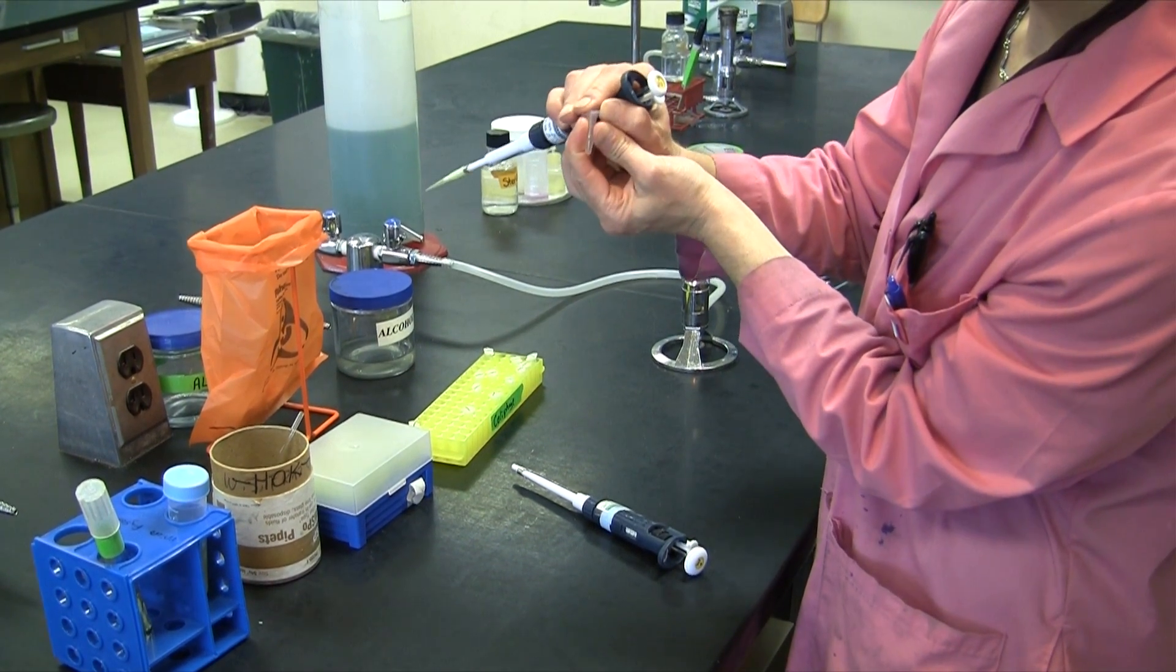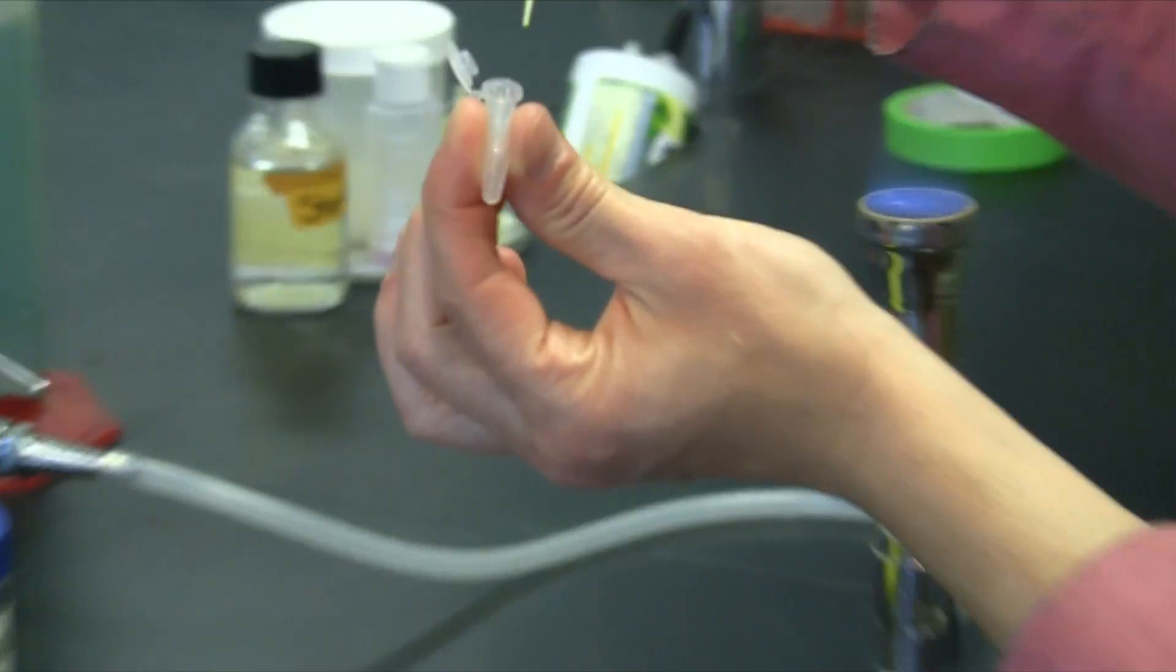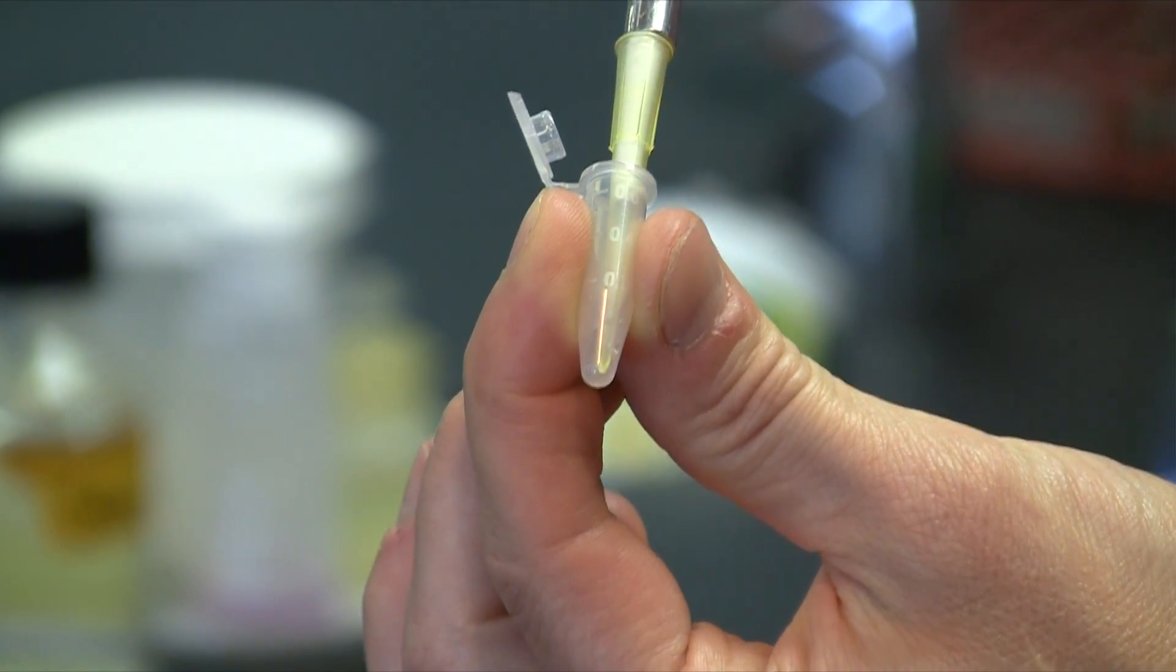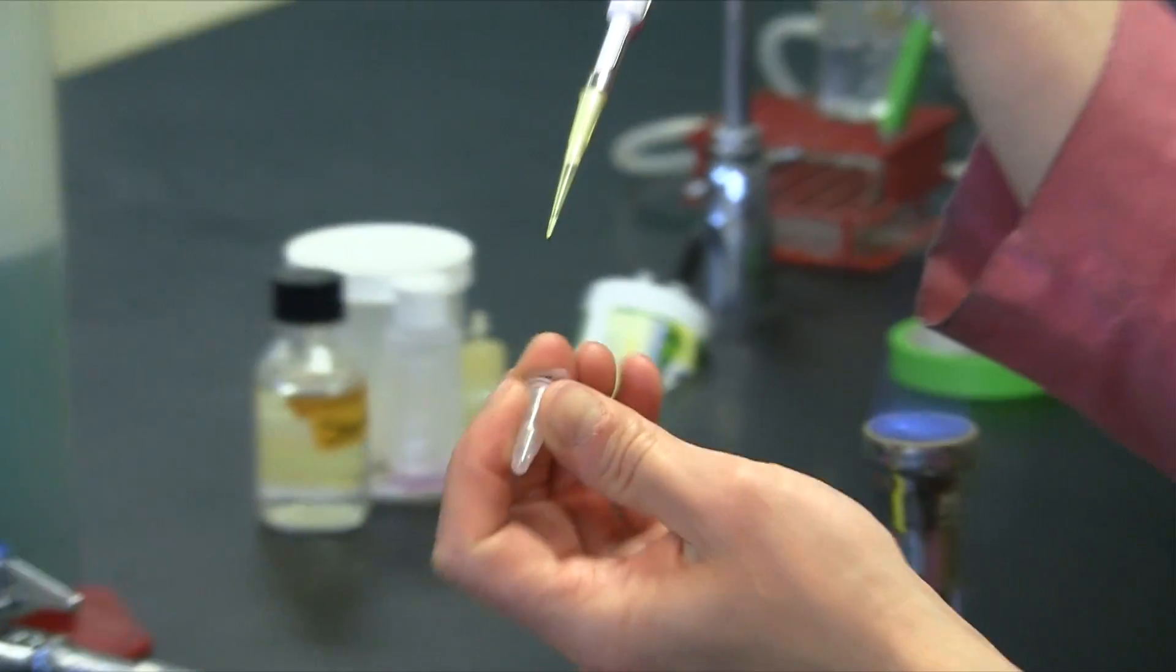Go ahead and tap your epitube down just a bit to make sure that the filtered sewage is on the bottom of the tube. And go ahead and take your 5 microliters.